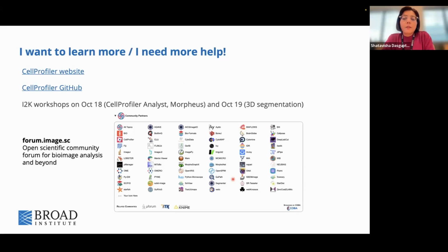So that concludes my overview, and I would imagine that there might be folks in the audience who want to learn more or who feel that this information was not enough and they need more help. The files that I have shared for today's workshop will contain a link to the CellProfiler website, which has a wealth of information. There are many more tutorials as well as some practice data sets available. I've also included a link to the CellProfiler GitHub for anyone who's interested in installing CellProfiler from the source.